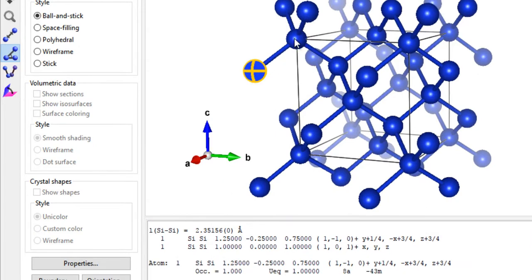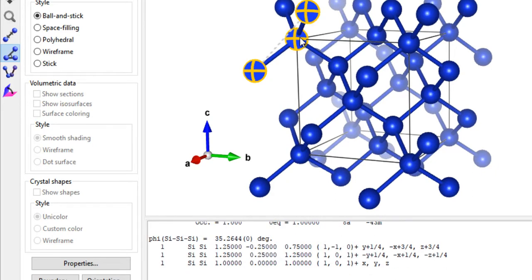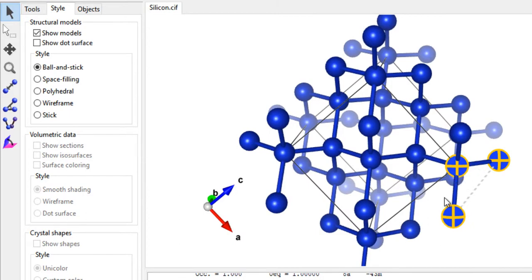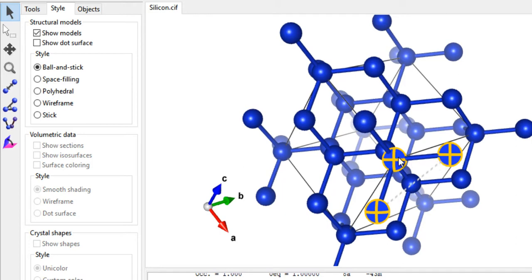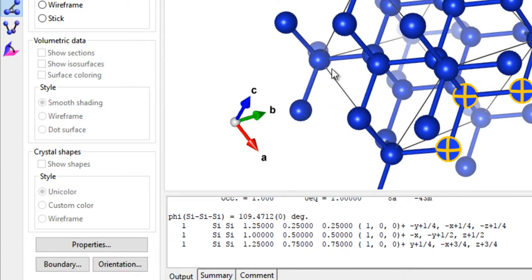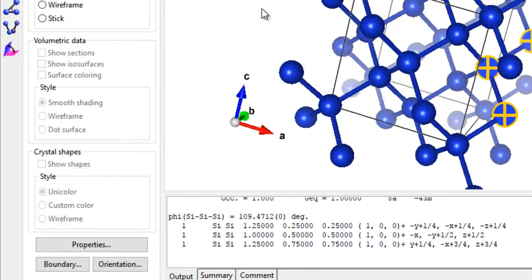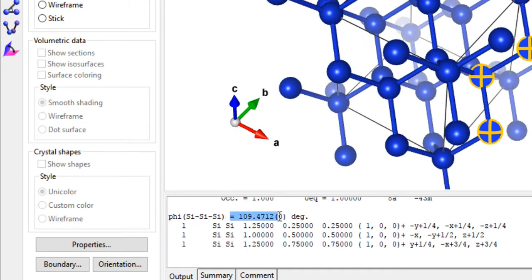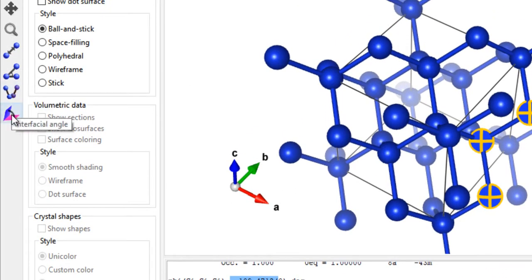The bond angle measuring tool lets you measure angles between bonds. You click three atoms in sequence — for example, click here, then here, then here — and it measures the angle at the middle atom. For silicon, this gives an angle of 109 degrees among those three atoms. This is another very useful measurement tool.